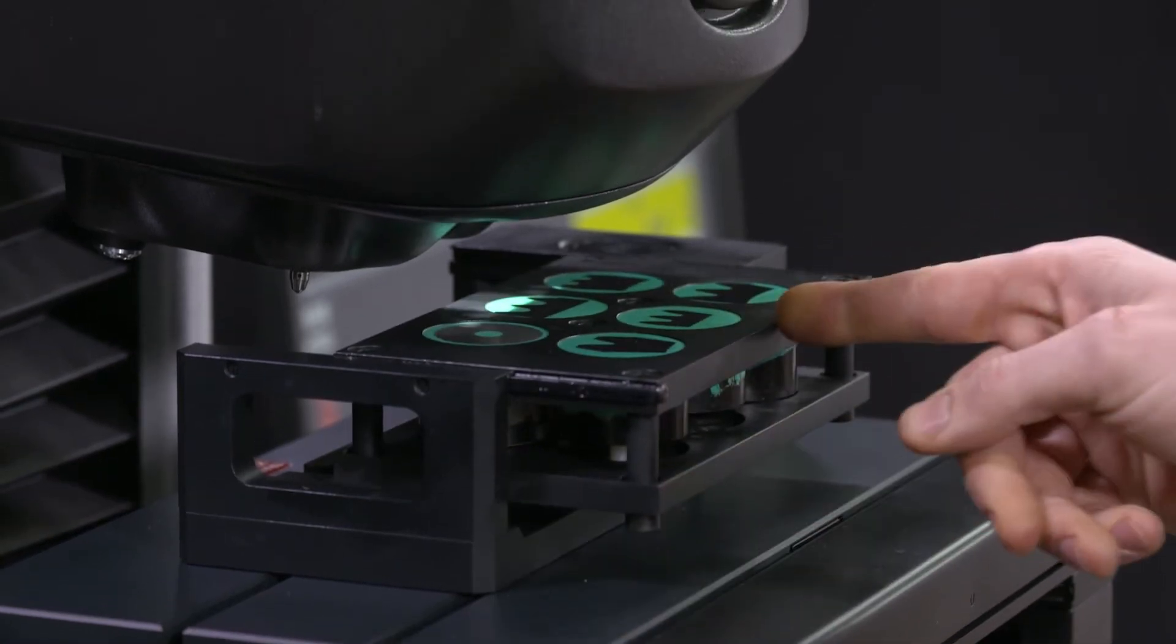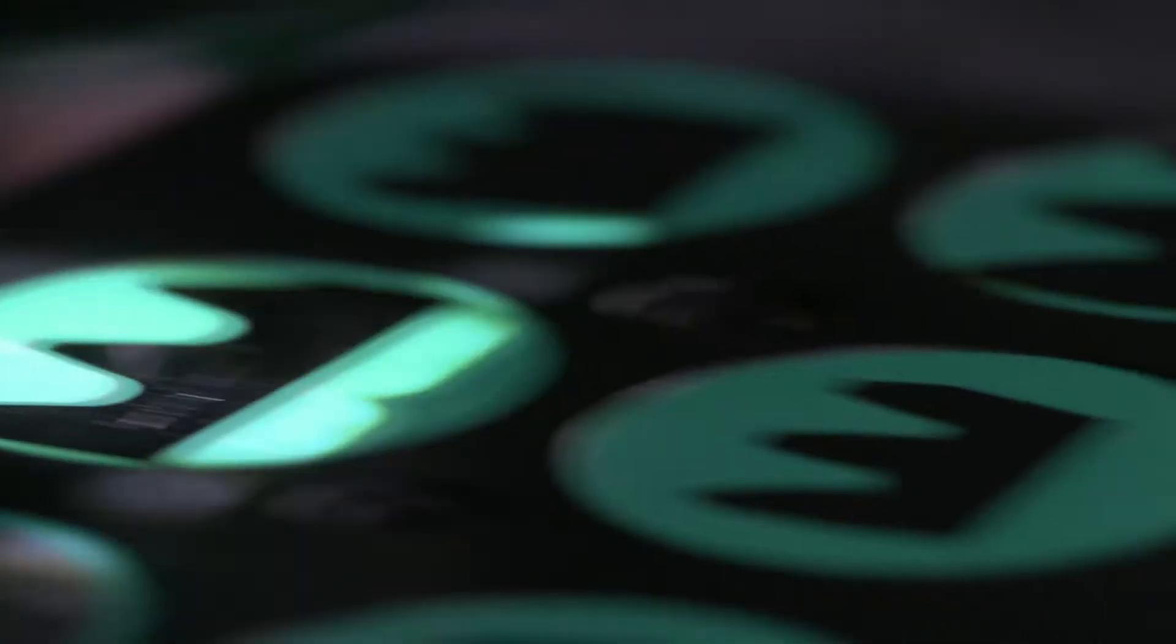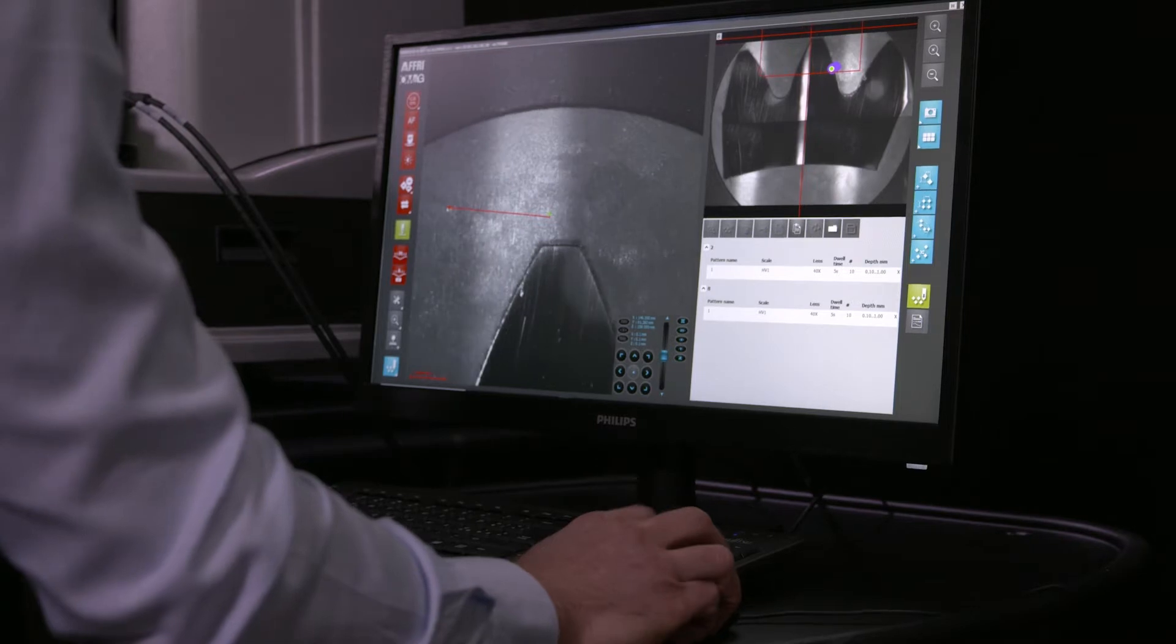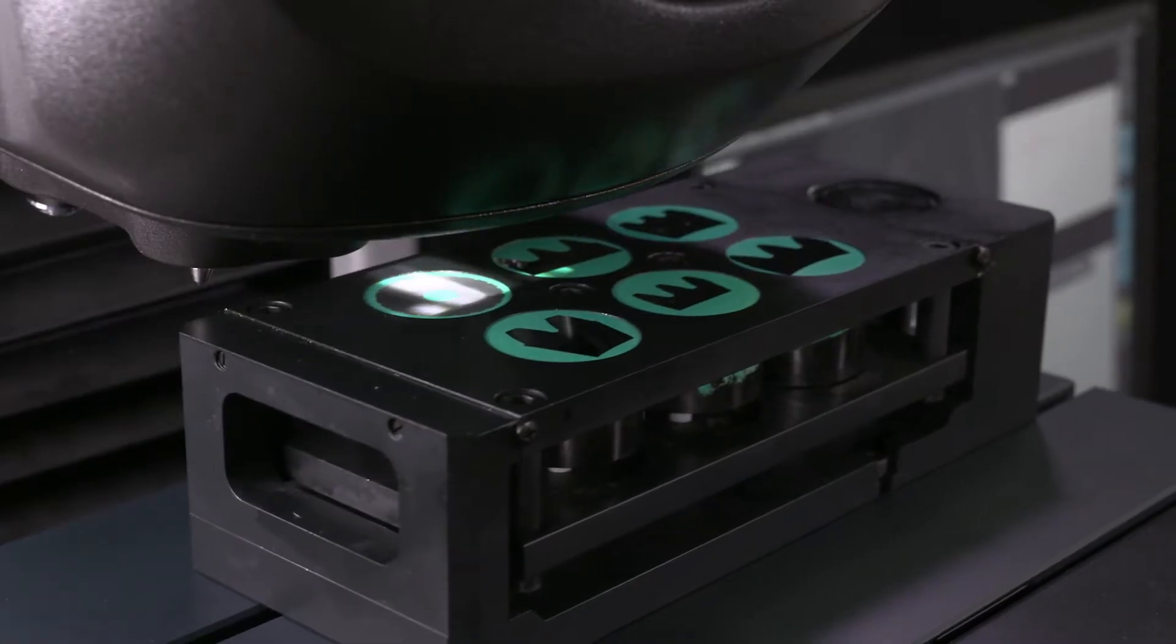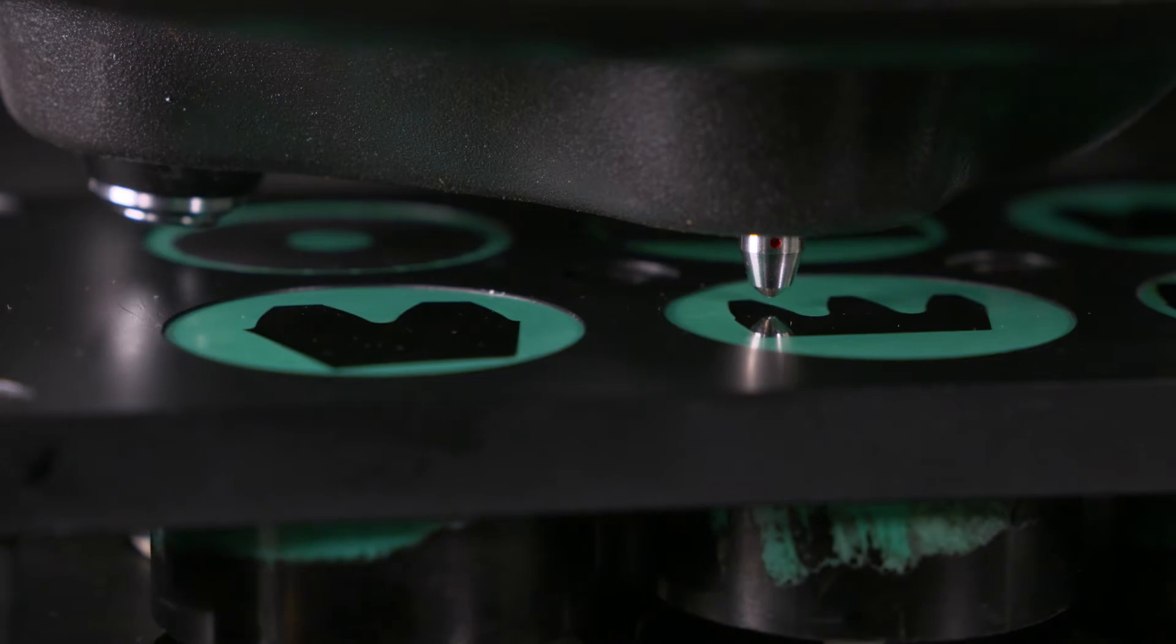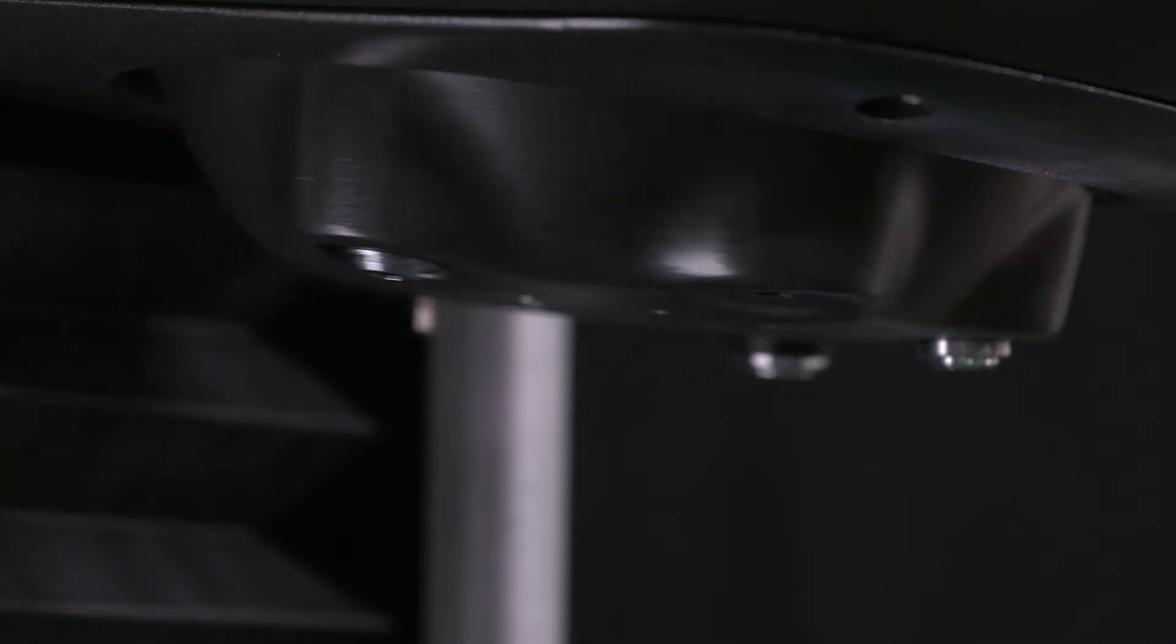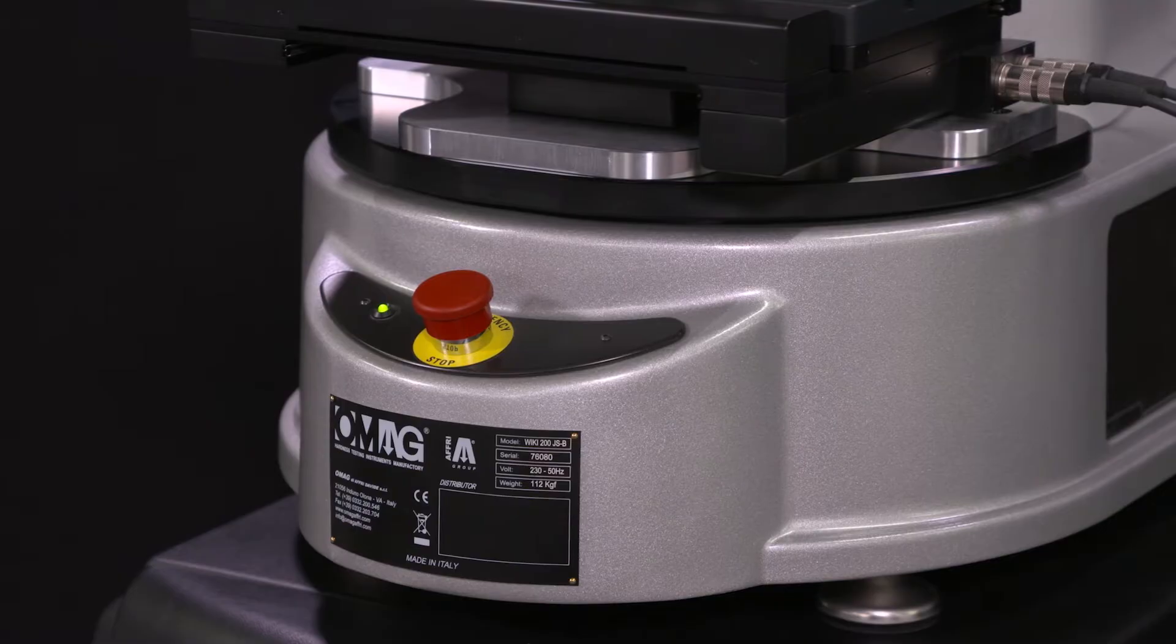All the operator has to do is program the test cycles and start the system without worrying about the number of specimens and measurements to be carried out. The hardness tester performs all tests in complete autonomy.